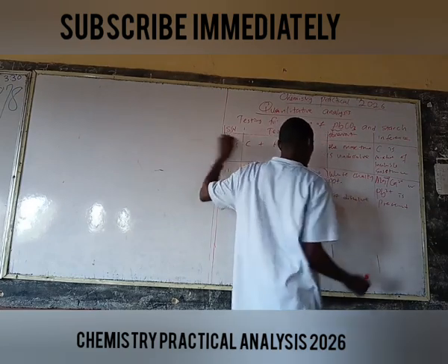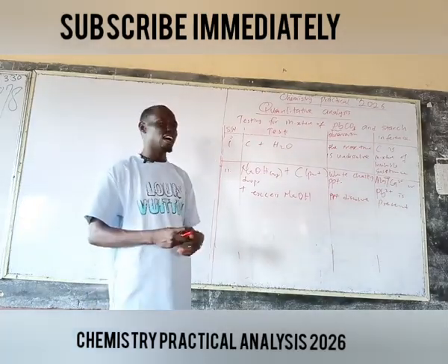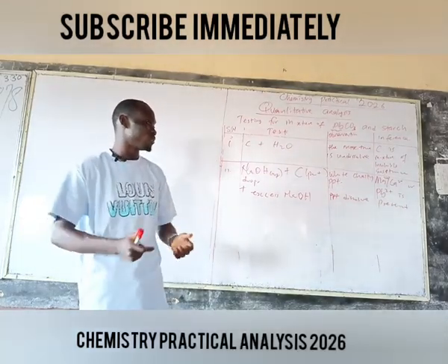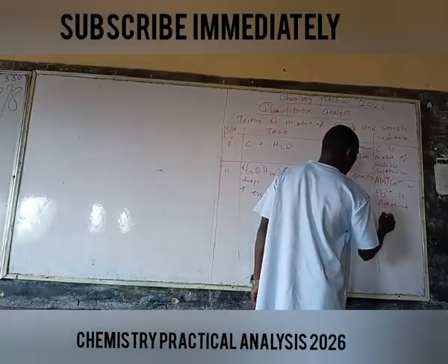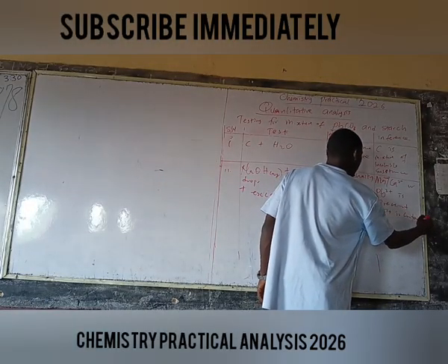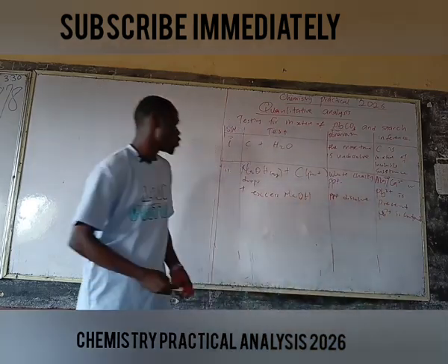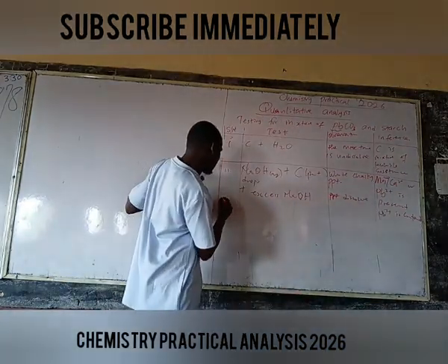When the precipitate dissolves, it means there is formation of a complex lead ion. You know, a complex ion is always soluble. So for the precipitate to dissolve, we say lead 2 plus is confirmed. Lead 2 plus is confirmed.